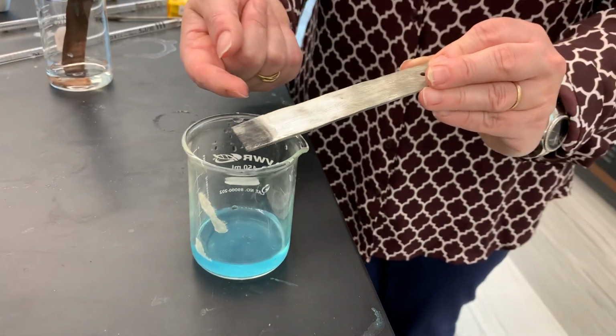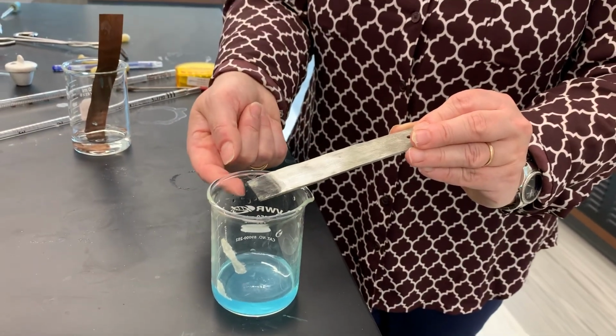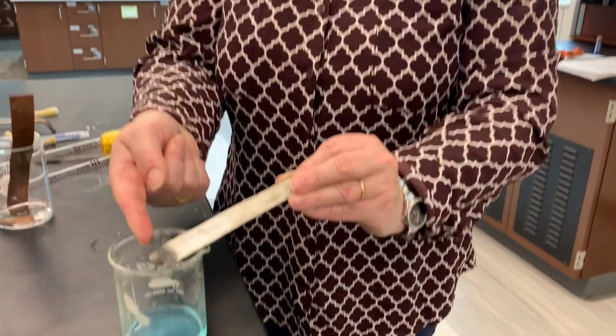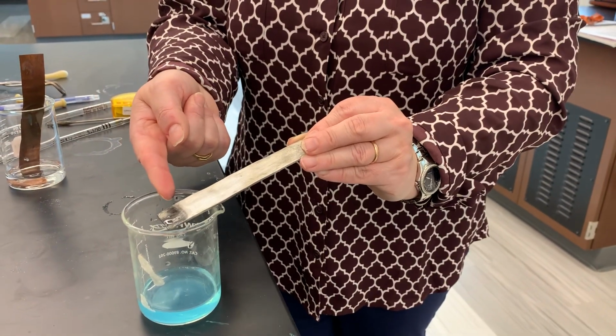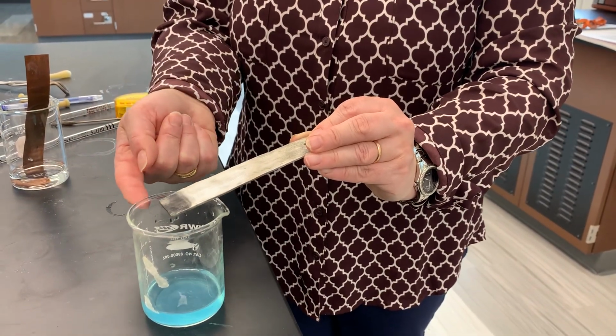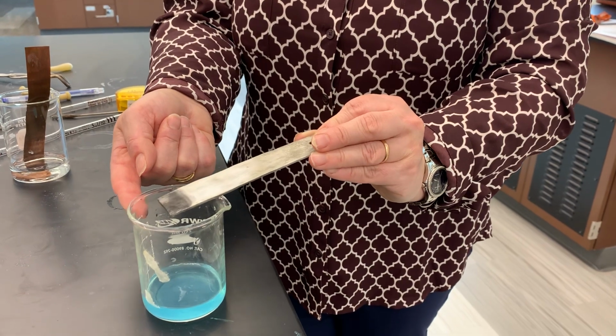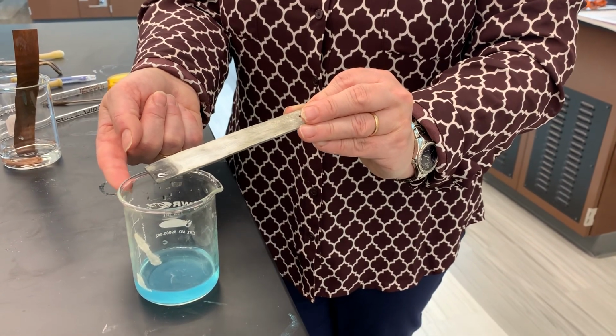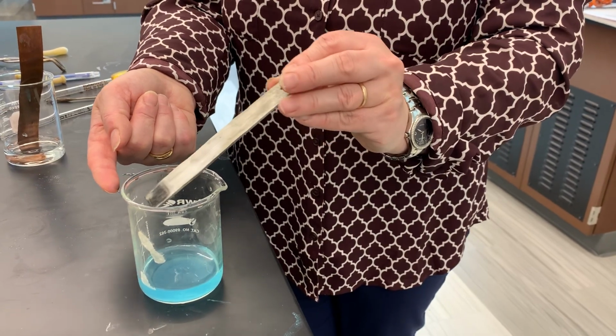So what is going on here? Well, what's going on here is that copper ions from this solution turn into copper atoms and begin depositing on the surface of the original zinc strip. So this black powder-like material on the surface of this strip is actually tiny atoms of elemental or metallic copper.